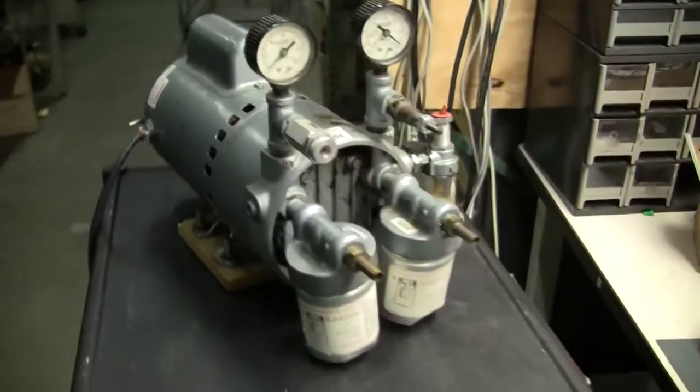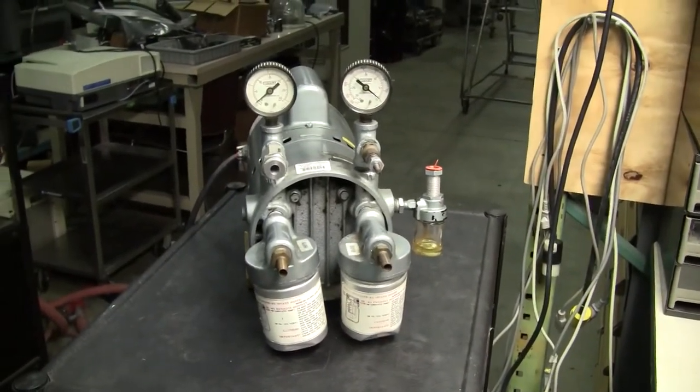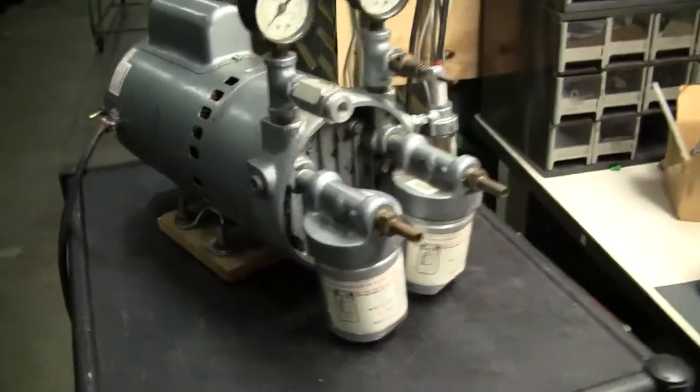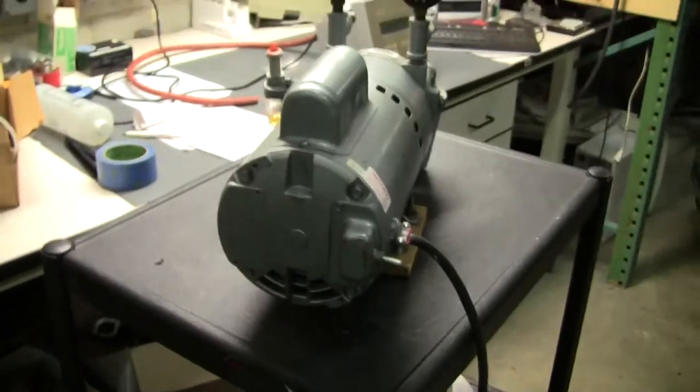This pump is used and being sold as is. If you have any further questions, please don't hesitate to call 609-518-9100. Thanks again from HitechTrader.com.